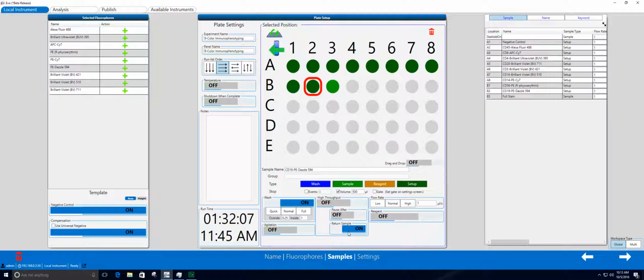And then once you do that, the fully stained sample FCS file recorded will have the compensation matrix with it, and you can also still adjust your data and analyze your data in third-party software because the FCS files are all exported with FCS 3.1 standards.